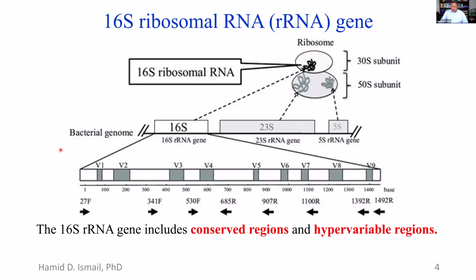Okay. So before you do this kind of experiment, you can read some papers and try to see what is the best region that you can use to design your primer. But I think for most of the primers, you can design the primer in this region.